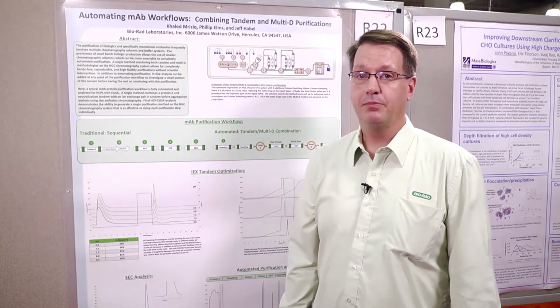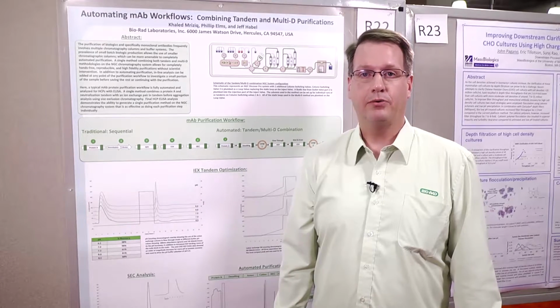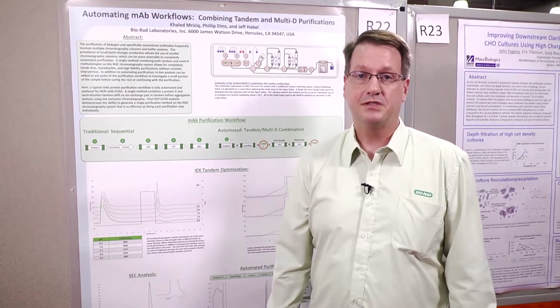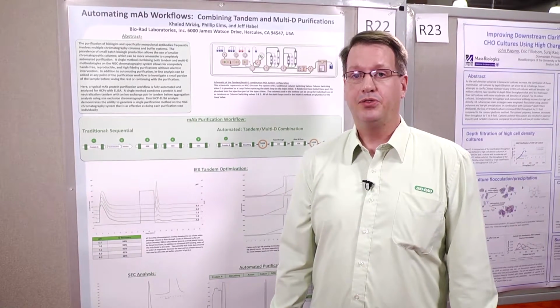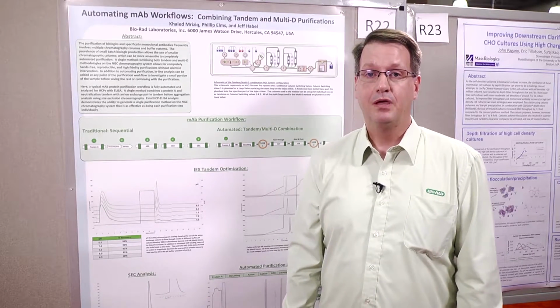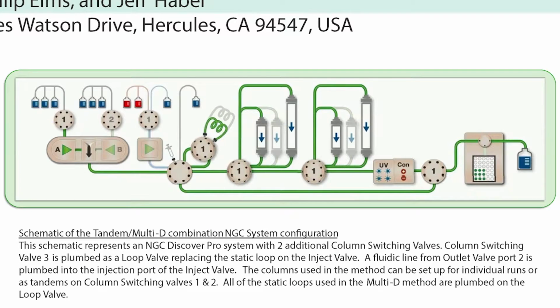Today I'm going to talk to you about a poster that we're presenting concerning an automation of a monoclonal antibody workflow. We're going to be doing this on an NGC system. What makes this unique is that we're going to combine both a tandem purification with a multidimensional purification. Here on the poster, we see the fluidic scheme of the system that we're going to use.